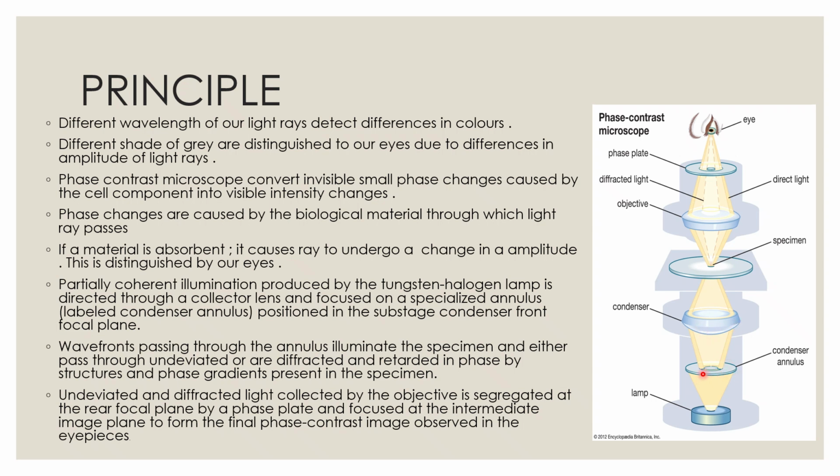Just like in the dark field microscope, we have a blocked out region around and in between, and only a small portion of unblocked region. Through this, the light passes through the condenser.